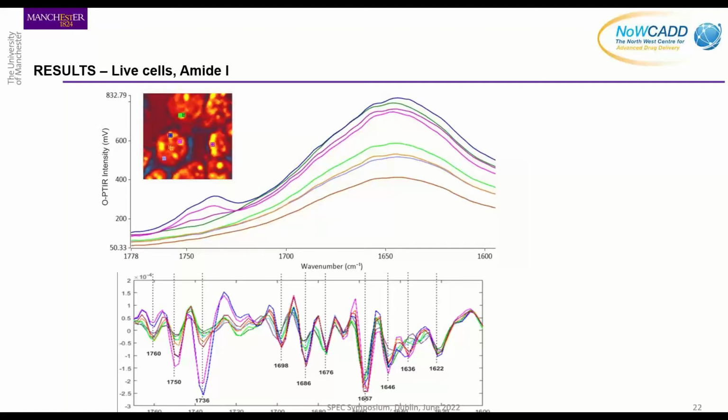The cells are still alive. We've done tests after all of the experiments. We can keep them alive for many hours. And this was a complete surprise to me that we would actually be able to at least see some structure and some structure changes.